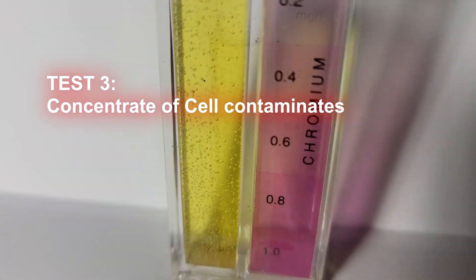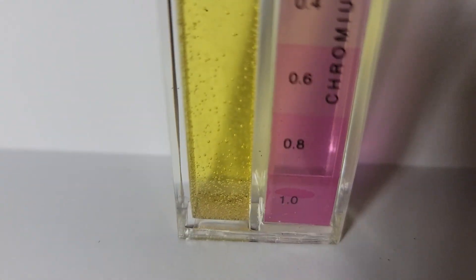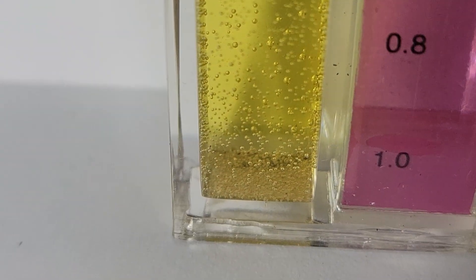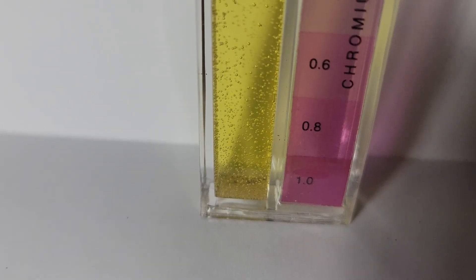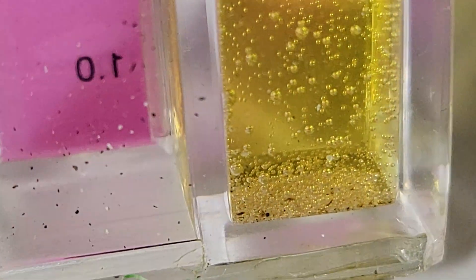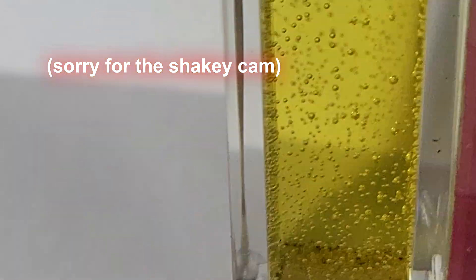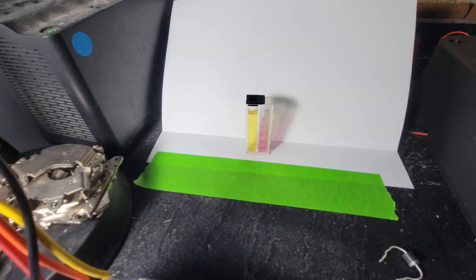All right, results are in. What happened to all our purple we had in there? We had a lot of sludge in there — a lot. And I don't see any purple in there at all. This has been well over six minutes. Did I leave it in there too long? Is there only a window? According to this test, there is no hexavalent chromium in this water bath.